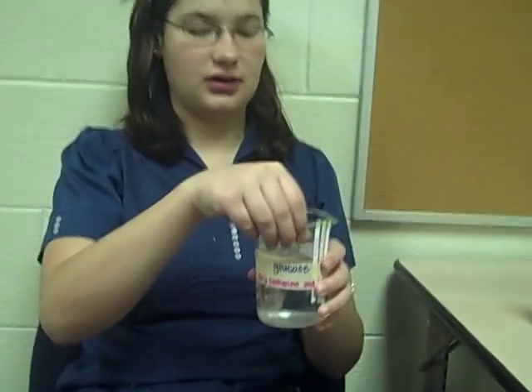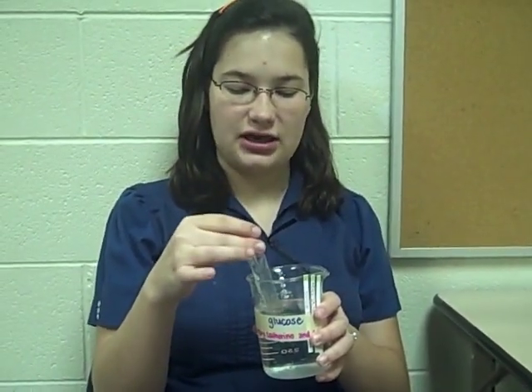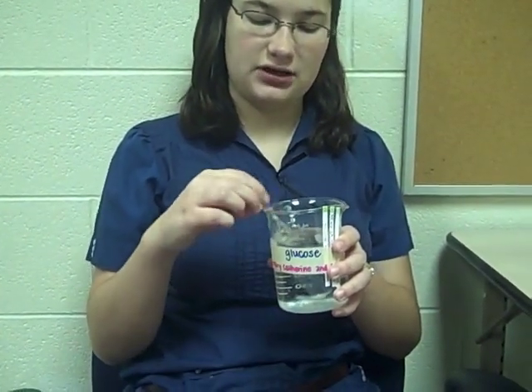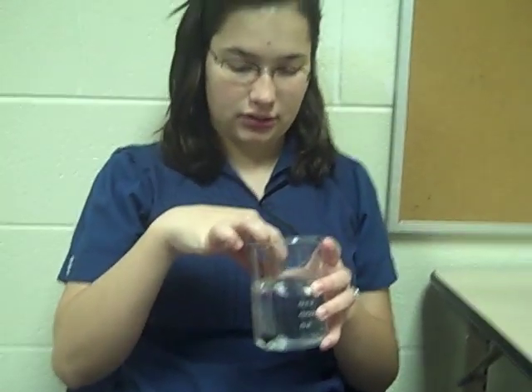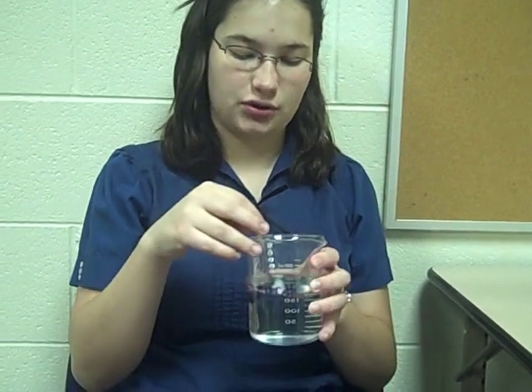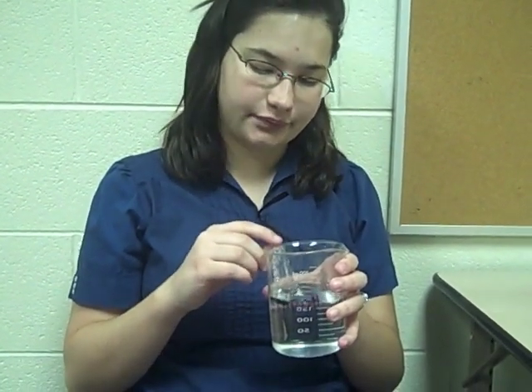So we started off our procedure. We added the glucose solution into the cellulose tubing, and then we placed it into 250 milliliters of distilled water, and we took the pH. For the starch, we placed the starch solution into the cellulose tubing and then placed that into 250 milliliters of distilled water and then added iodine.